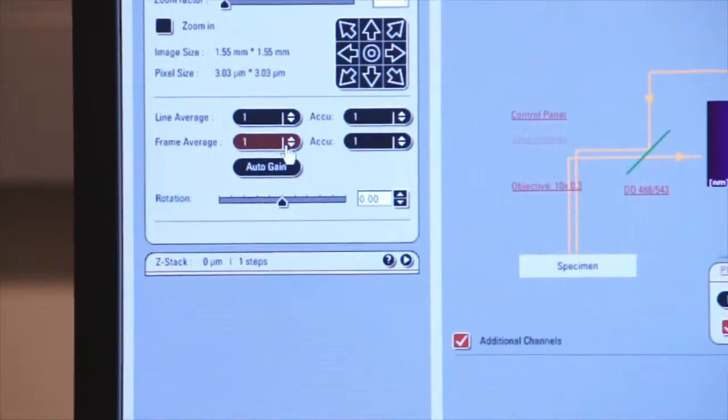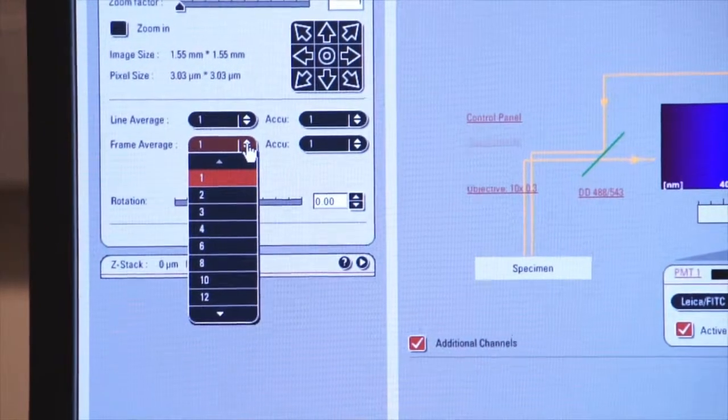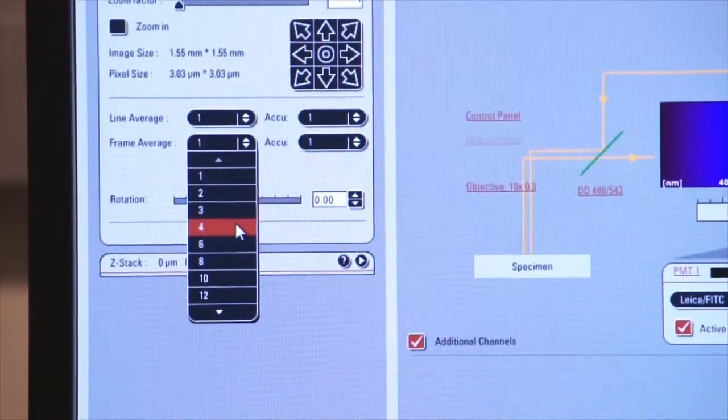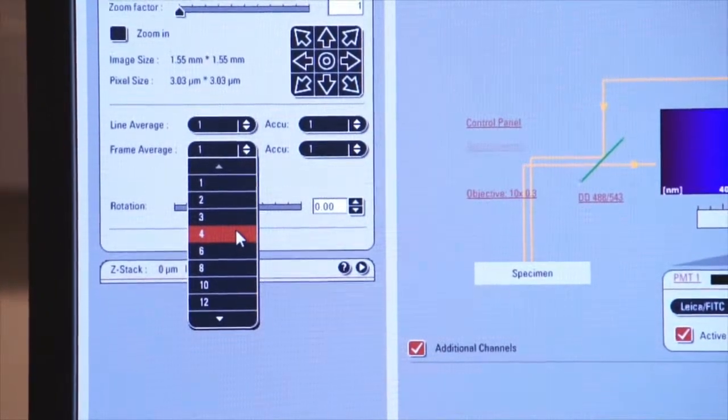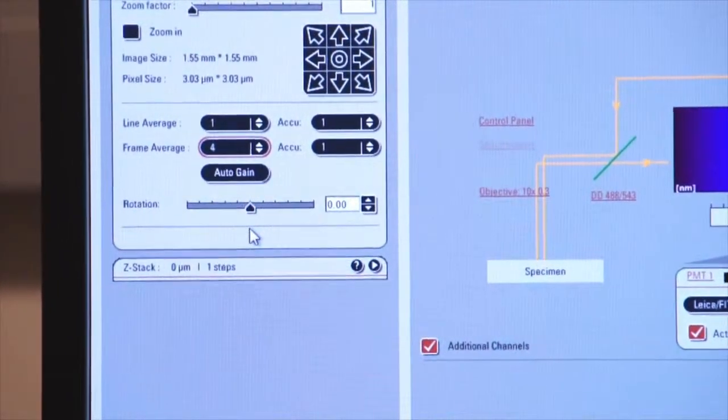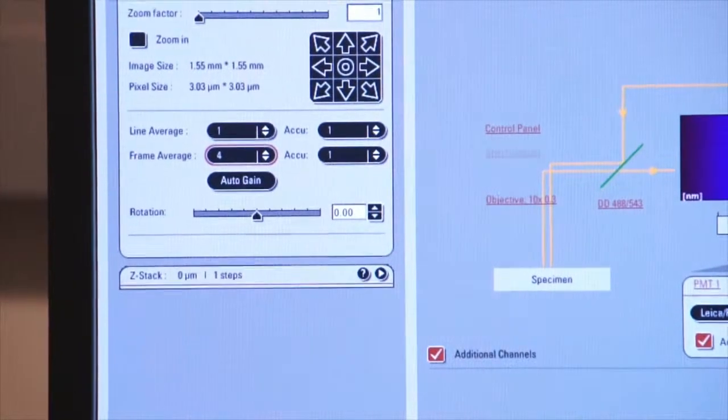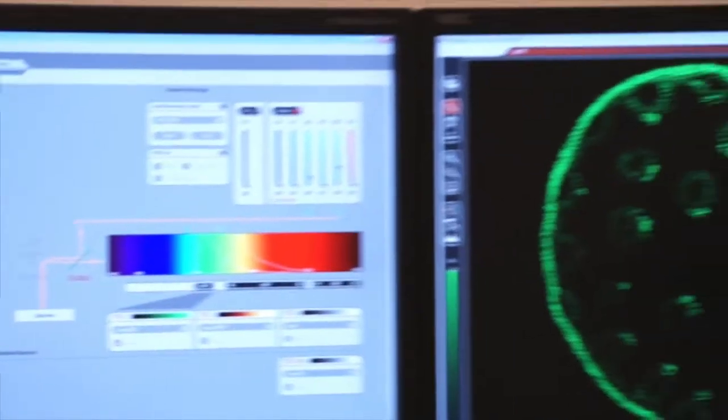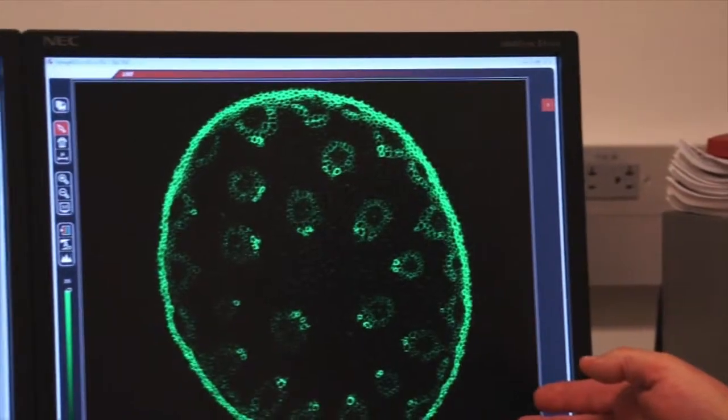And now we'll try a frame average. You can also average the number of frames that you take per picture. So we'll do four frame averages and if I click on capture image, I've told the system to take an image, but do four different frames.